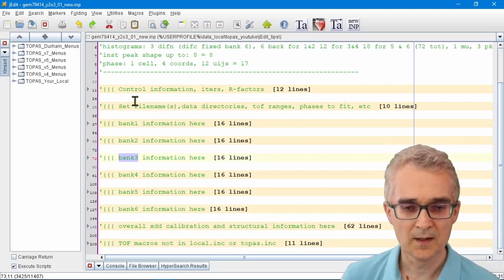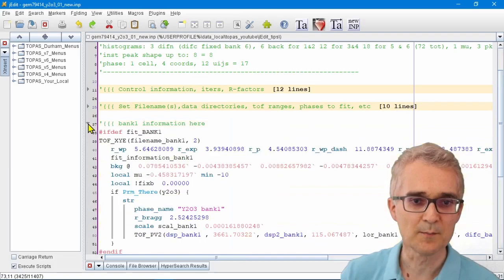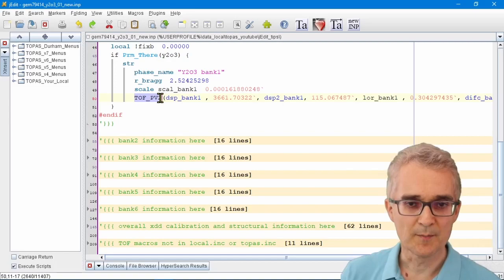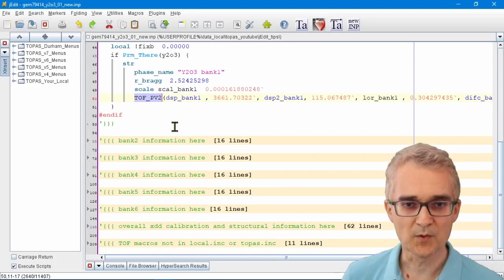With complicated input files like this, you might want to be looking through them. For example, this line here describes the peak shape in each of the banks. I might be interested in the peak shape parameters in all of these banks and might want to look at them all simultaneously.